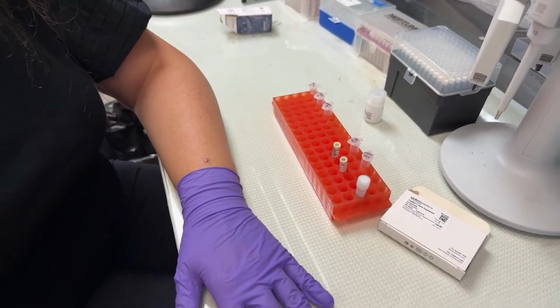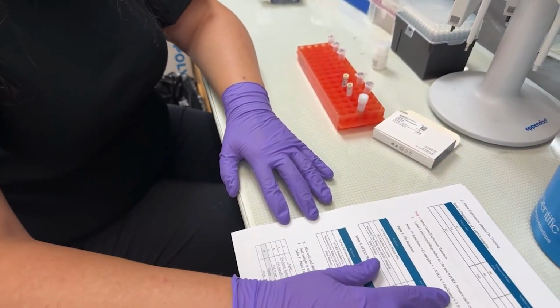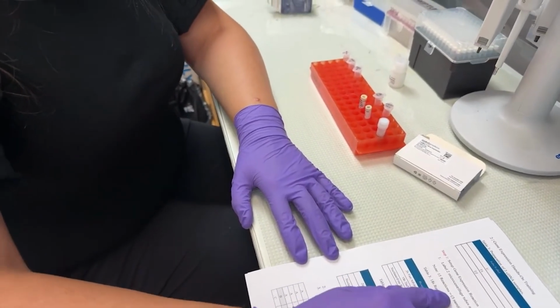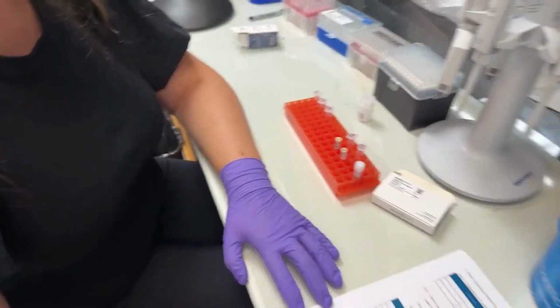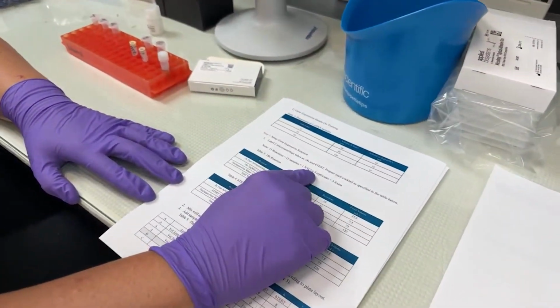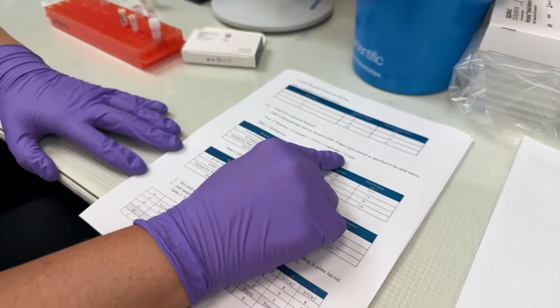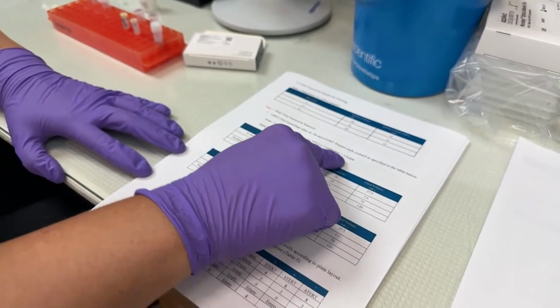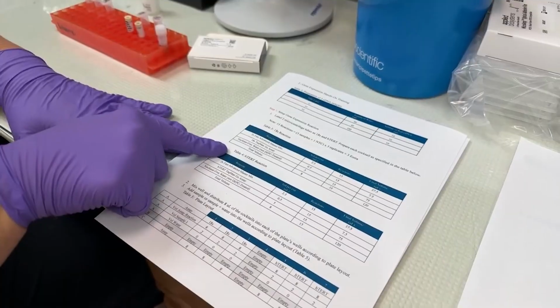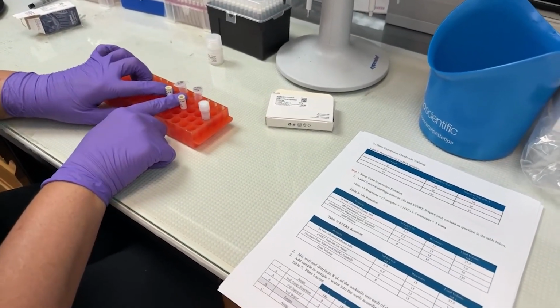So I'm going to make enough for all of my reactions plus some extras. We're going to have 3 samples plus 1 no template control. I'm going to run each of those in triplicate, so 3 replicates, and then I'm going to make a few extra just in case I have any pipetting errors. So I'm going to make all of that in bulk for each of my 2 reactions, and I have 2 tubes prepared here, so let's get to it.